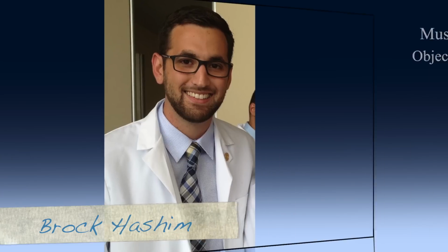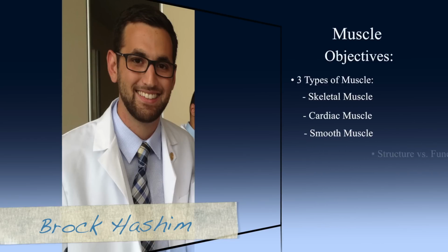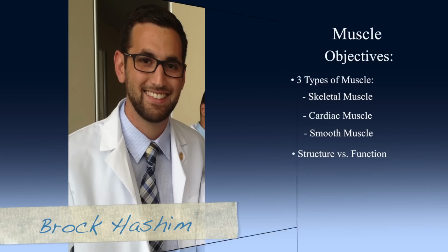Our objectives today will be to identify the 3 types of muscle: skeletal muscle, cardiac muscle, and smooth muscle, and to be able to explain the similarities and differences in structure and function between these muscle types.